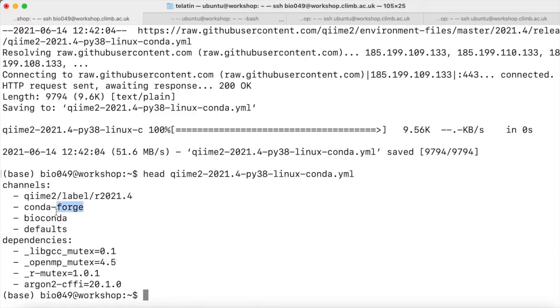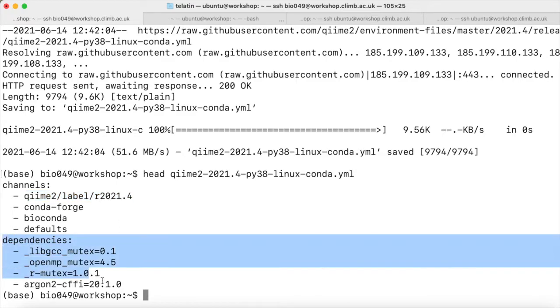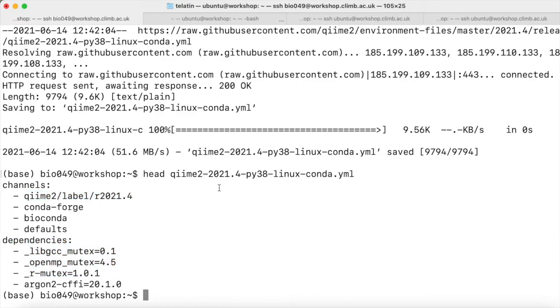The channels are Defaults, Conda Forge, Bioconda, and also a specific QIIME 2 label R2021.4, which is the version of QIIME 2 we are going to install, followed by a list of all the dependencies. With HEAD, we just printed the first ten lines.